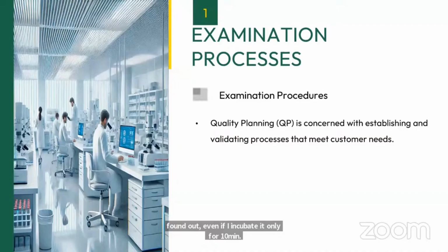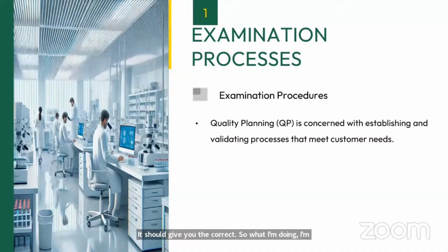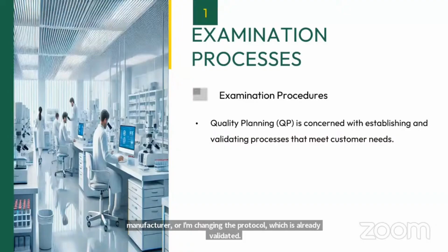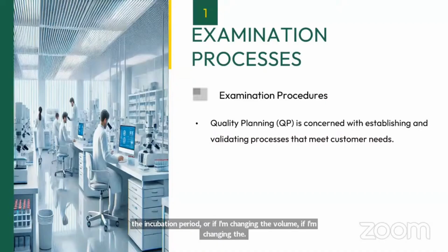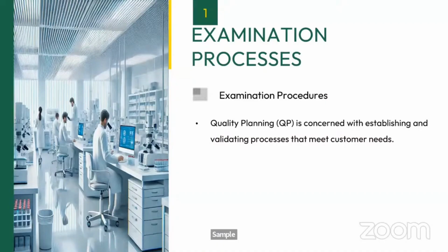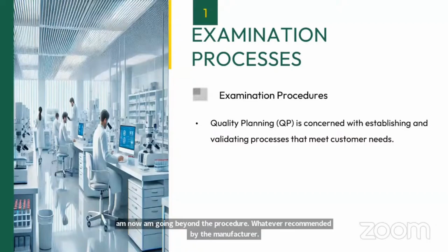So I am changing the protocol which is given by the manufacturer, or the protocol which is already validated. So if I am changing the incubation period, the reagent volume, or the sample volume, if I am making any changes to this, again I have to perform the validation, because I am going beyond the procedure recommended by the manufacturer.